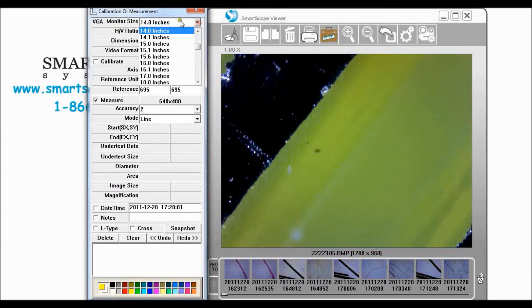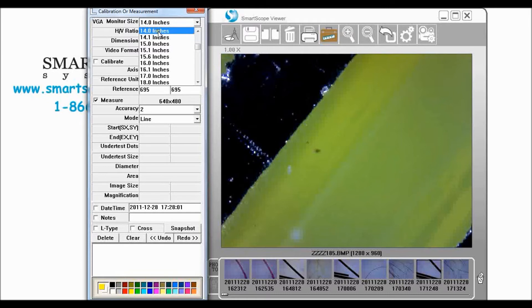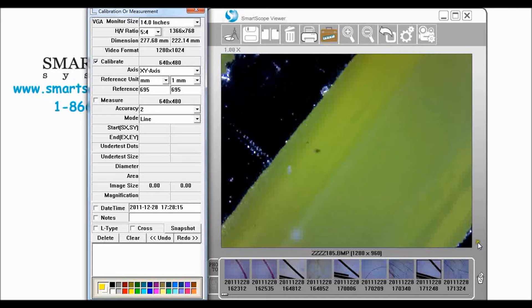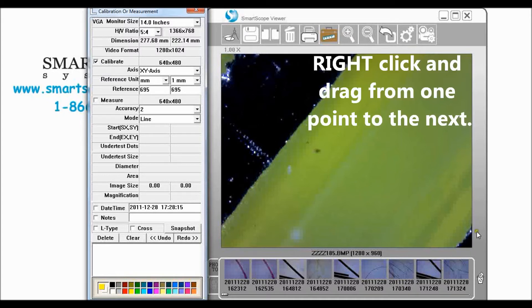Now I've already selected the size of my computer screen and so I want to come up here and click calibrate. What we want to do is we want to go from the left side of this marker to the left side of this marker.